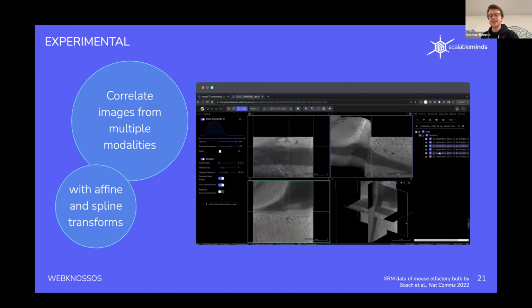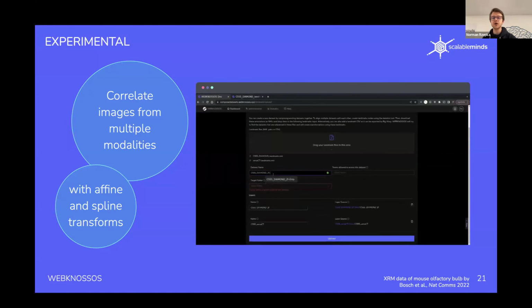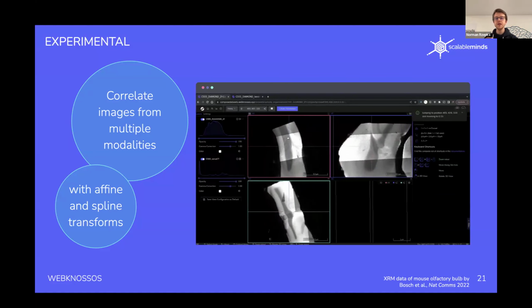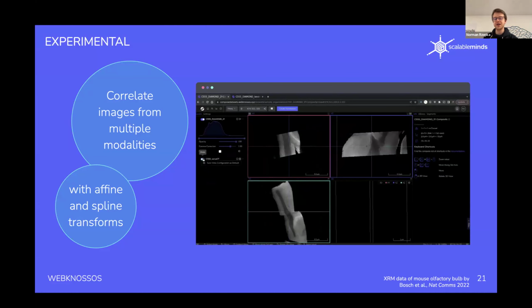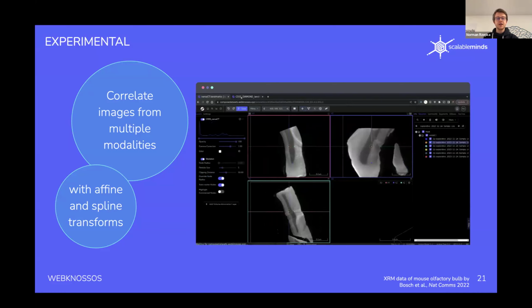But you can see that you can overlay them nicely, and then on top of that, you can also do the annotation work just as you would with normal data sets. This feature is still a bit experimental, so if you want to try that out, then please do. And if you find something that we should add, then please let us know.